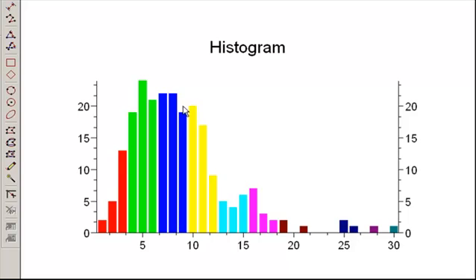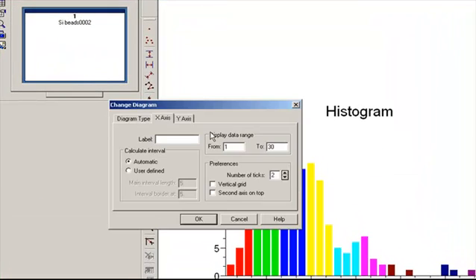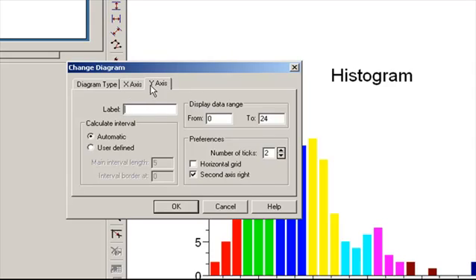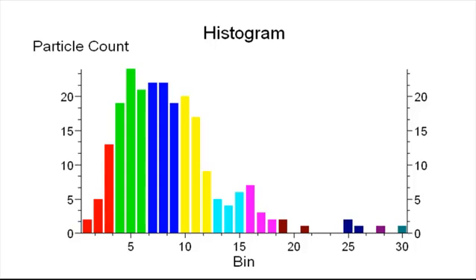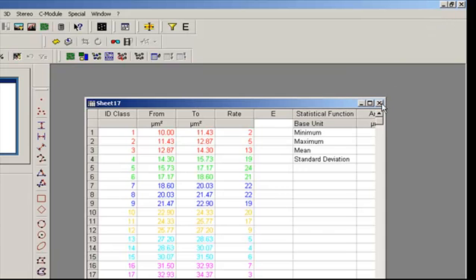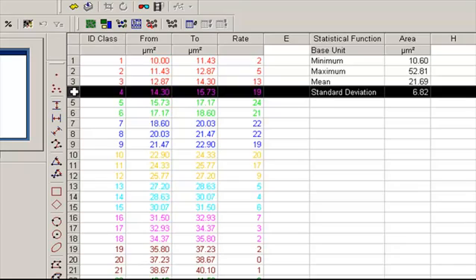You can change the amount of bins and it will simply change the shape of the graph. Right-click on the histogram and click Change to modify the labels of the X and Y axis. The X-axis can be labeled 'bin' and the Y-axis 'particle count.' Each bin on the histogram corresponds to a certain range of particle sizes. By minimizing the histogram, a sheet is automatically generated that displays the bin number and the range of particle sizes. For instance, bin number 4 contains particle sizes ranging from 14.3 to 15.73 square microns, with 19 particles fitting that criteria.